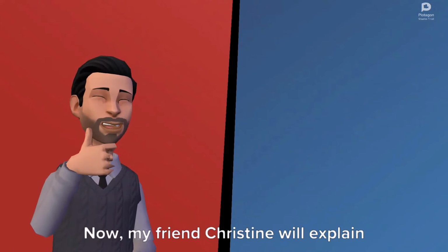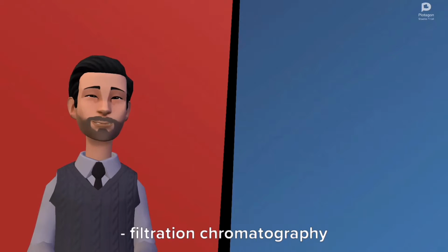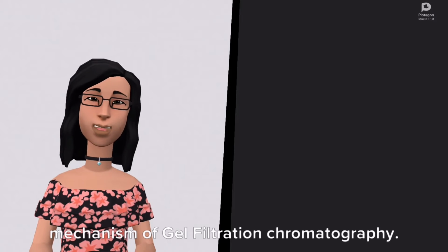Now, my friend Christine will explain in depth about the mechanism of gel filtration chromatography. Thank you, Paul. Now let's see the mechanism of gel filtration chromatography.